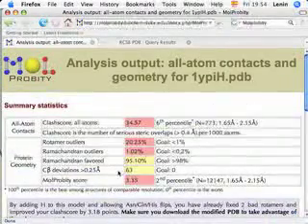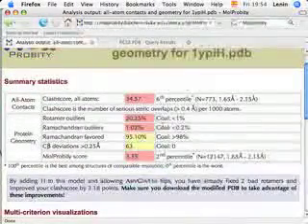In opposition to our expectations, this structure appears to be worse than the low-resolution one. It has more clashes between its atoms and also has more rotamer outliers. Maybe the higher resolution structure will be of better quality.